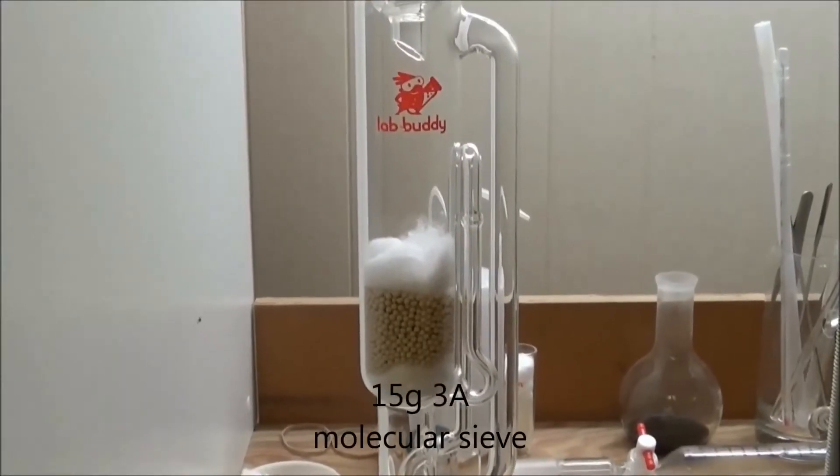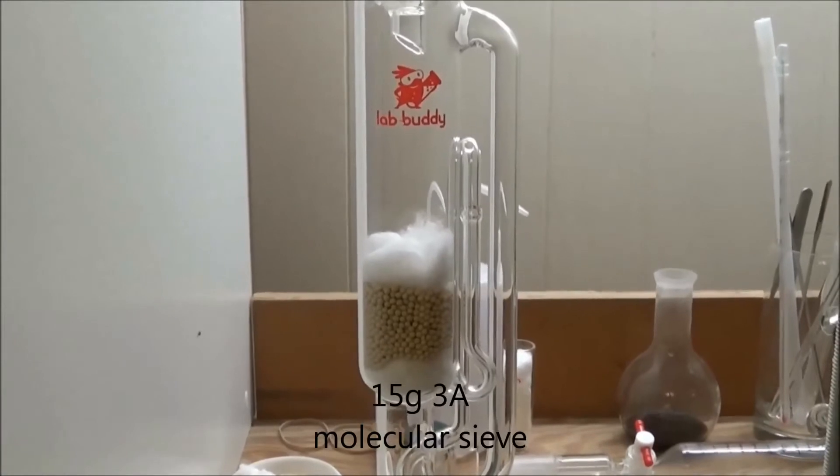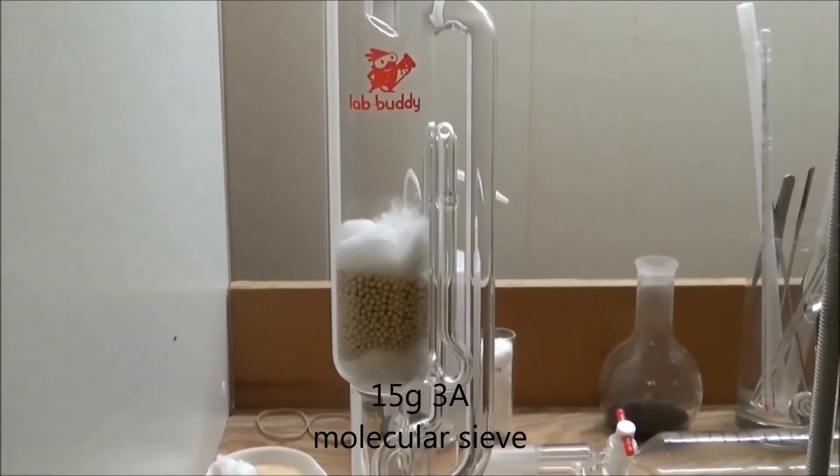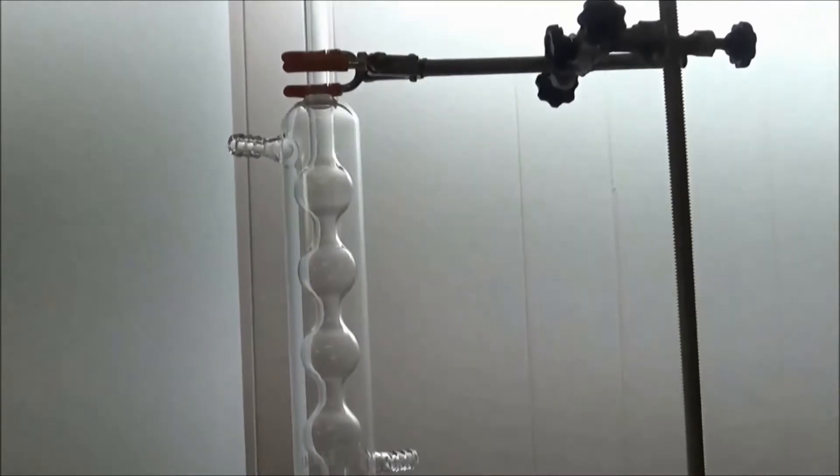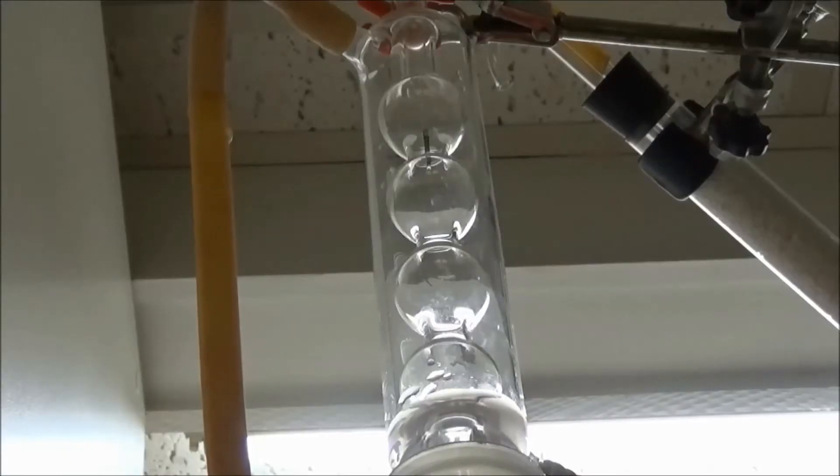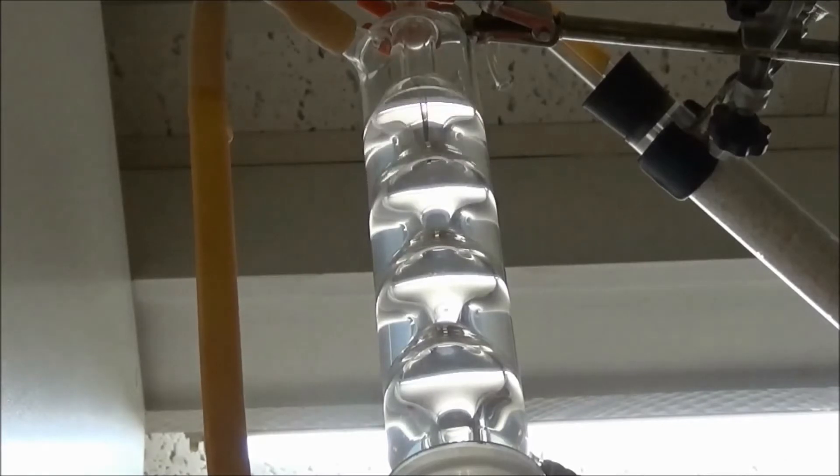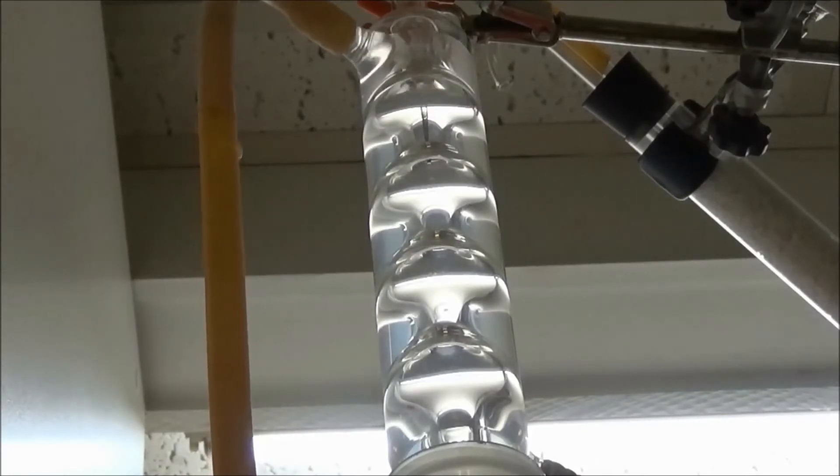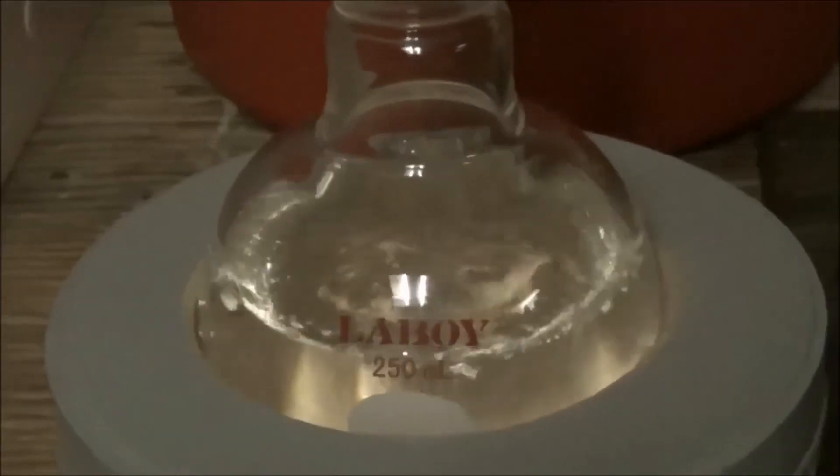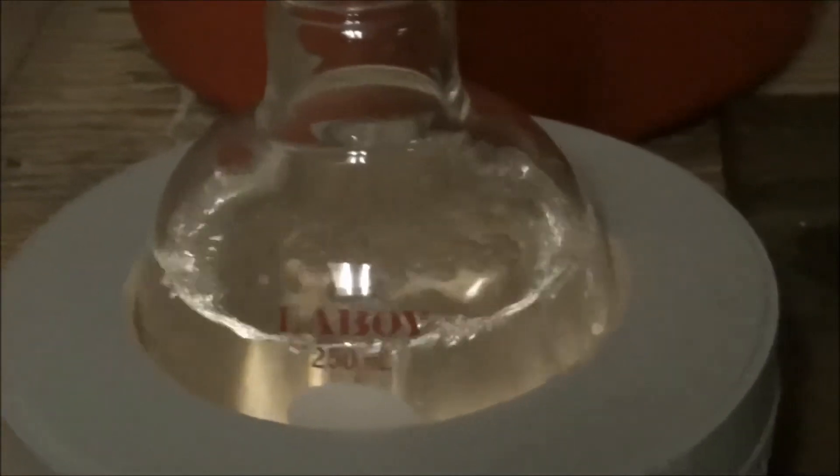Over the flask I set up a Soxhlet extractor which was packed with 15 grams of 3A molecular sieves. Water was started to the condenser and I attached a drying tube to the top of it. The flask was brought to a boil and left for two hours.